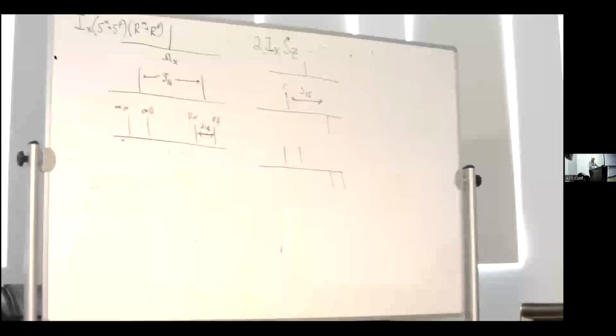We can see only three. Pardon? We can see only three. ABC. The fourth one would just be a 90-degree pulse followed by two tau. Oh, okay. And that one we already know, right? For that, you get evolution of chemical shift and evolution of J coupling.